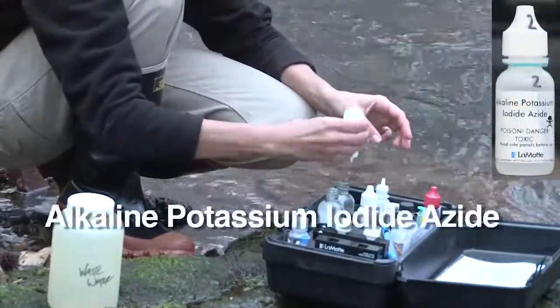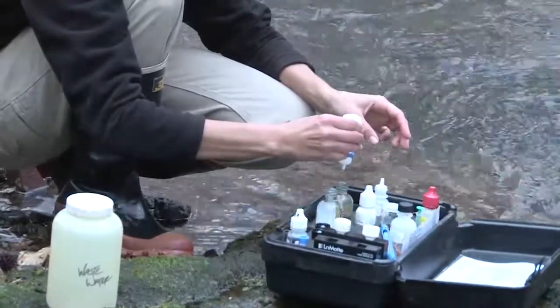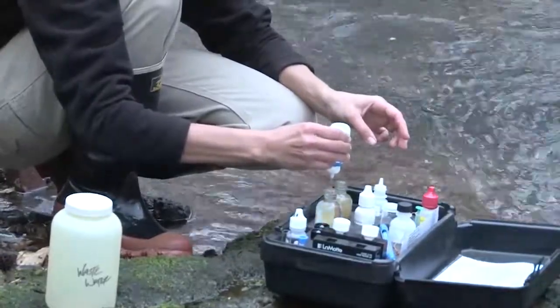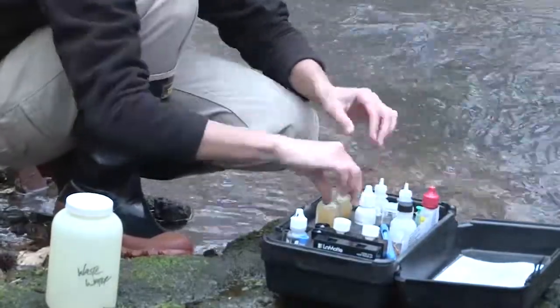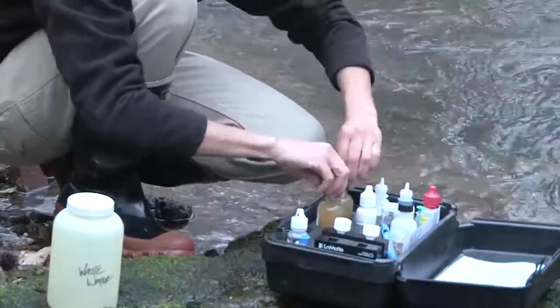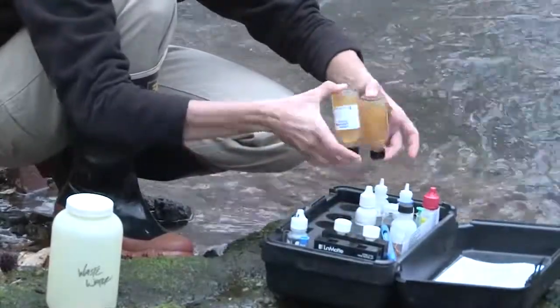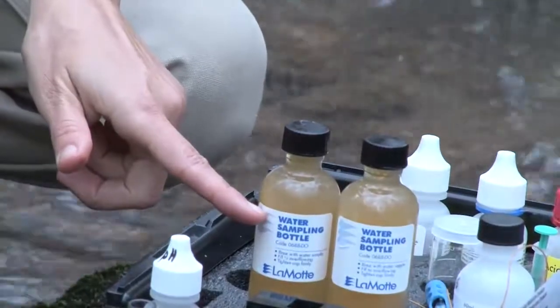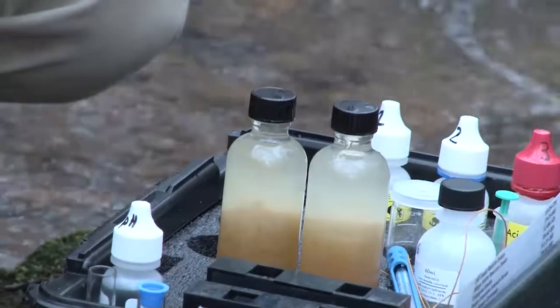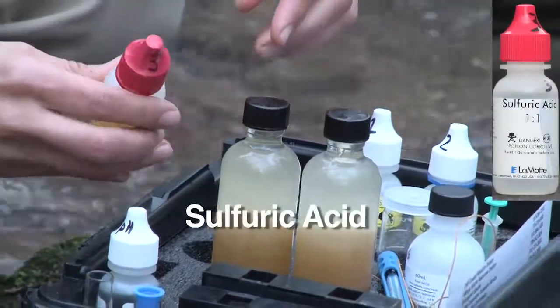Now, the second reagent. It's okay if some of the water sample overflows the bottle — the reagents will sink to the bottom. She caps the sample bottles and gently inverts them several times to mix the chemicals. You'll start to see a precipitate form. Once the precipitate settles below the neck of the bottle, you're ready for the next step. Now we add the third reagent, sulfuric acid.